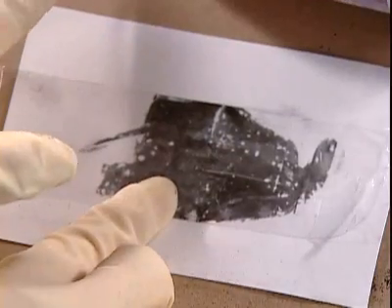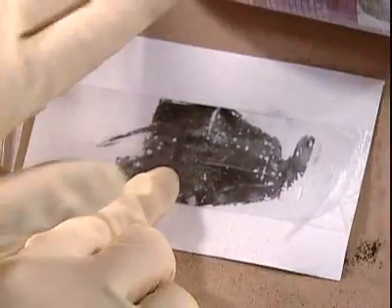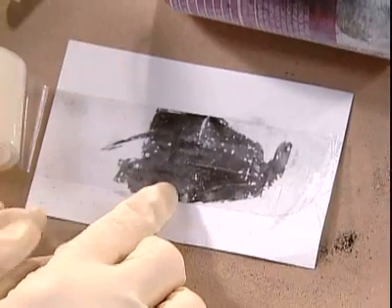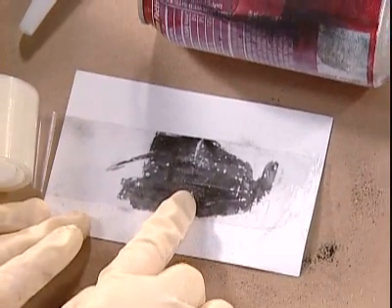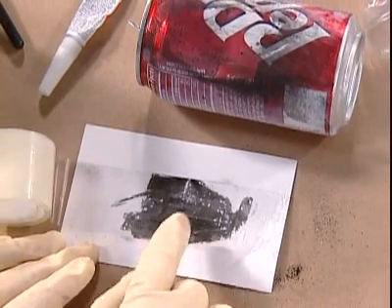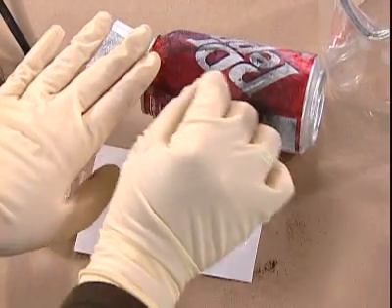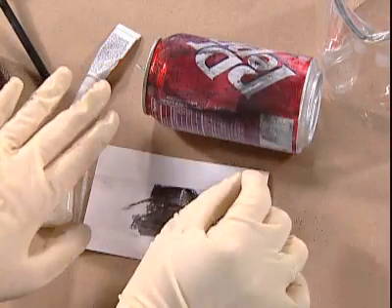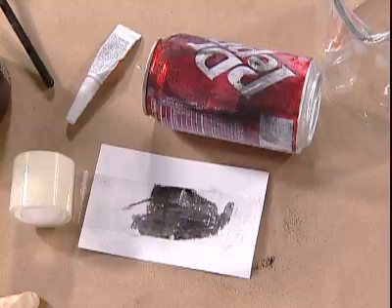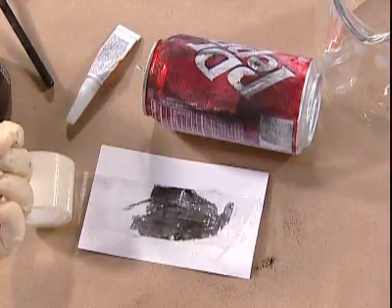Now, because this is such a great technique, I can lift this many, many times if I wanted to. In other words, if this lift wasn't as pretty or as usable as it could be, I can always take a new piece of tape, put a little bit less powder, and try and lift it again. You could do this almost 20 times because, remember, that oily residue is now super glued to the surface.